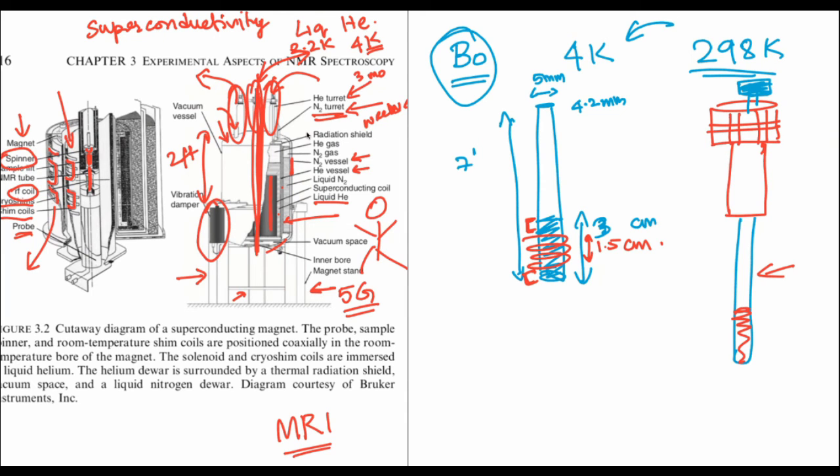Yes, I thought while taking the data, we need to push it up and down. That's what I thought. No. While you see, the airlift is just to get the sample in and it stays there until you push it out. The spinner also needs air to spin.